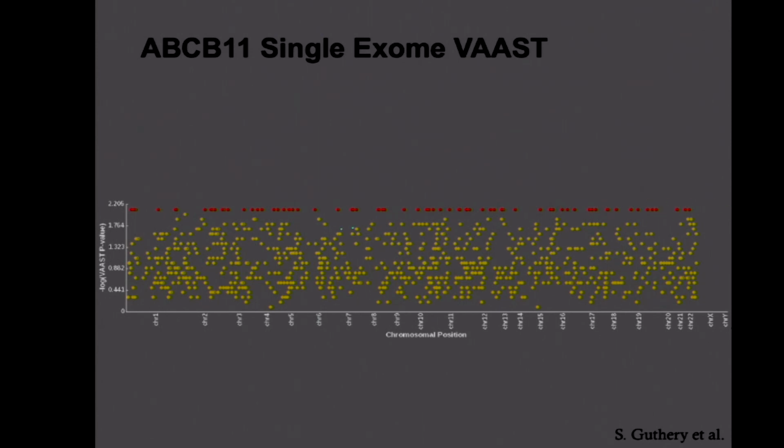And so we have a real plateau of potentially causative alleles here at the top, and the answer is in there, but we have to go through that entire list of genes to try to figure out the answer.